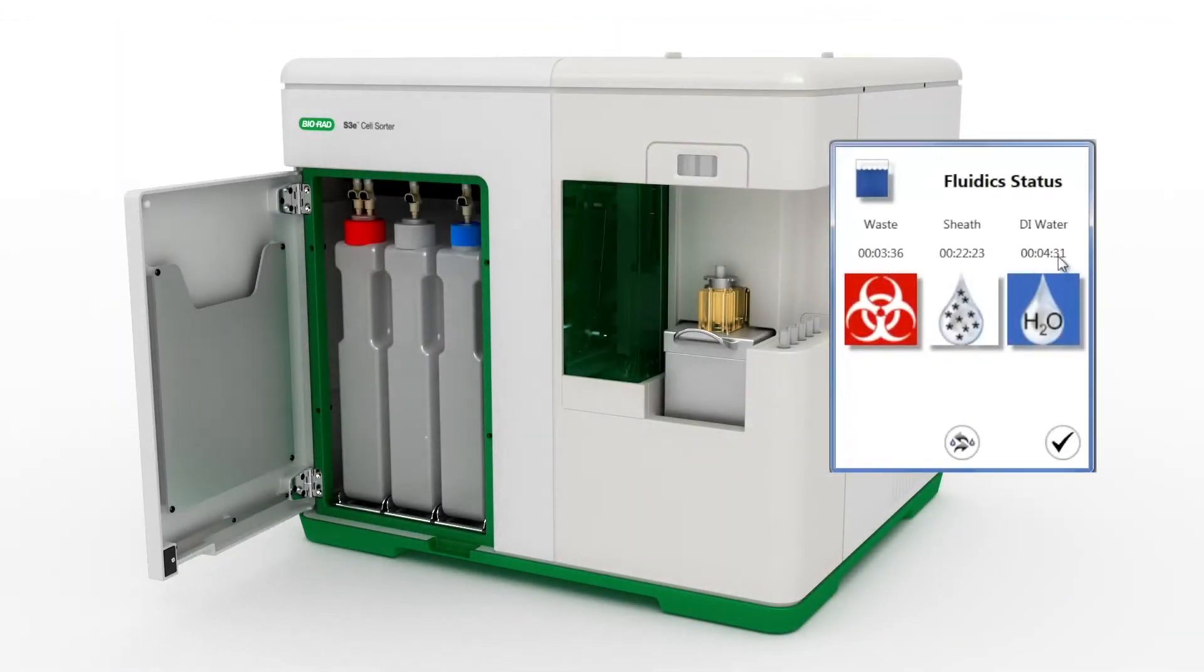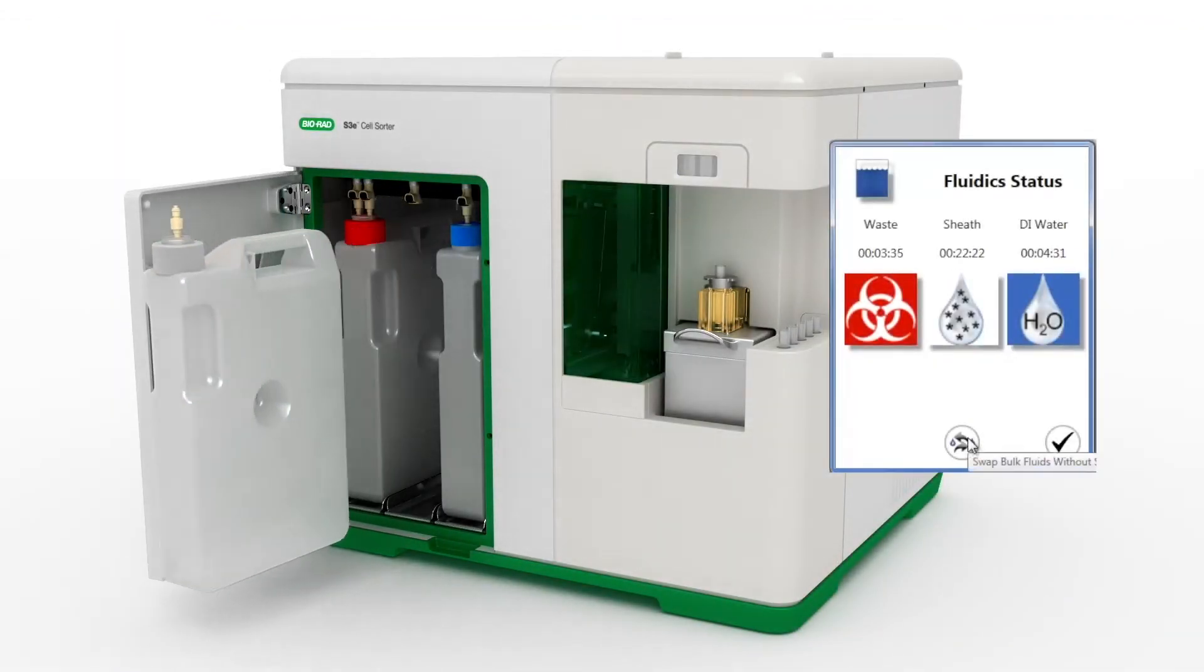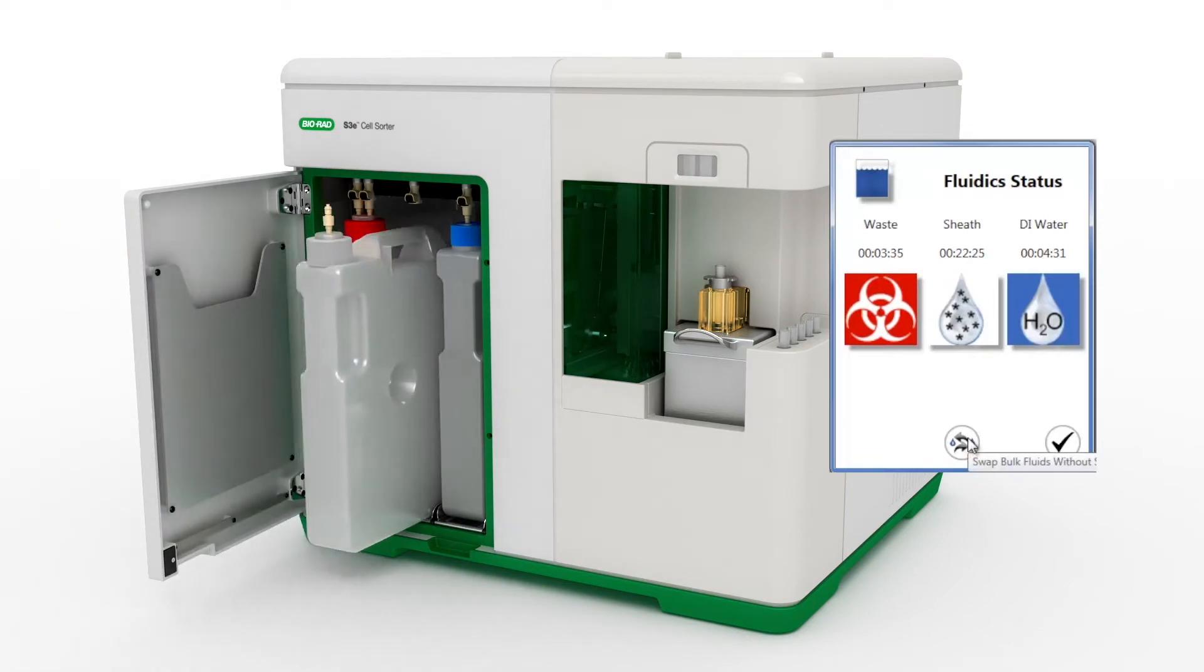The internal reservoir system even lets you swap tanks on the fly without having to shut down or recalibrate and repressurize the system.